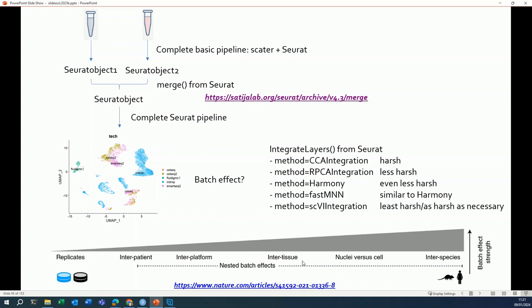But here, this case has a strong batch effect, but this will not work with the Seurat CCA method, because when you compare different tissues, you expect to have different cell types, and then CCA doesn't work. Strong batch effects are also when you try to combine different platforms, so for instance 10x Genomics and SmartSeq data, as is the case here in this example that I show on this slide. So these are all different platforms, and you see that they produce a very strong batch effect.